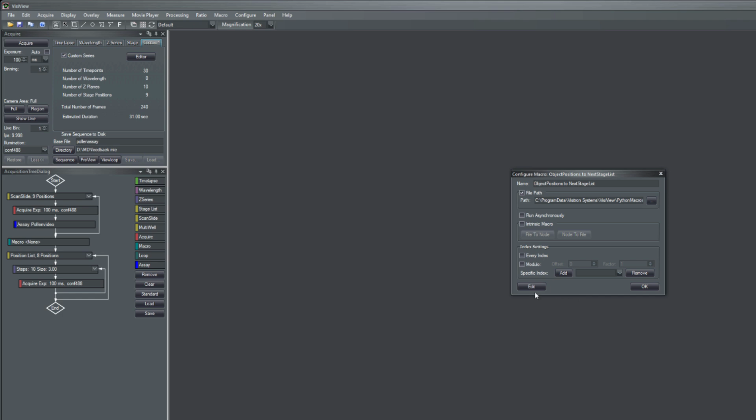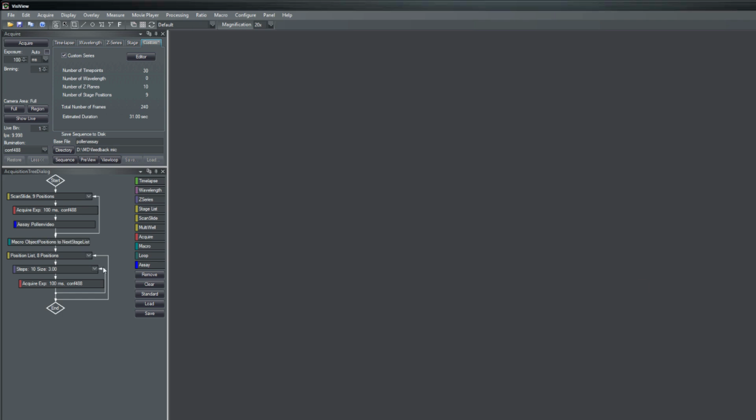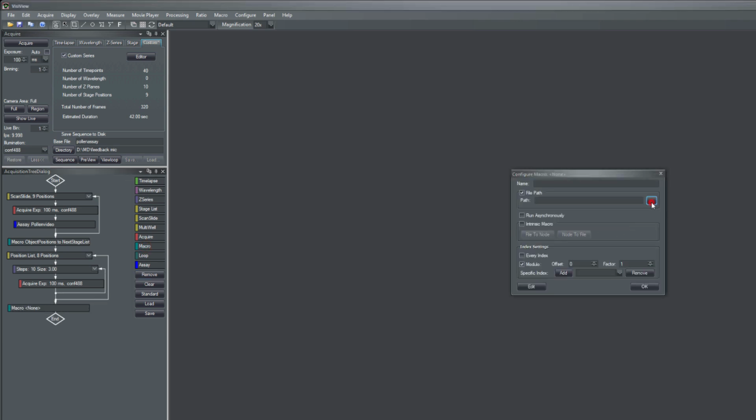In the end, I thought it would be nice to display the pollen as a maximum projection and crop the center as the pollen are quite small. A positive side effect is that the amount of data to store is reduced to a minimum.